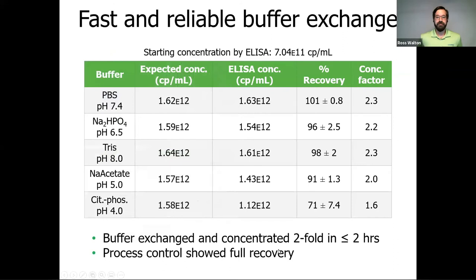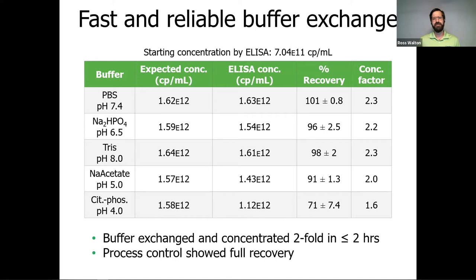Big Tuna was able to complete all buffer exchanges and concentration in under two hours. Looking at the first row, the process control showed a full recovery of about 100%, which is great. The other buffers had similarly high percent recoveries, except for that citrate phosphate buffer, which had a really low percent recovery. We were using ELISA to quantify concentrations before and after Big Tuna, and since all other buffers were working as expected, we thought something special was going on with the citrate phosphate buffer. Using UNCLE, we were able to find out what that was.